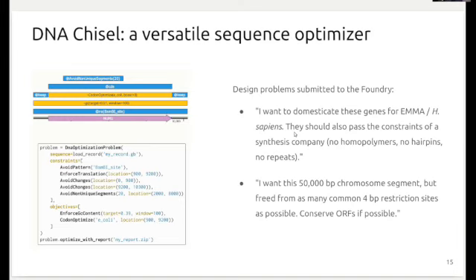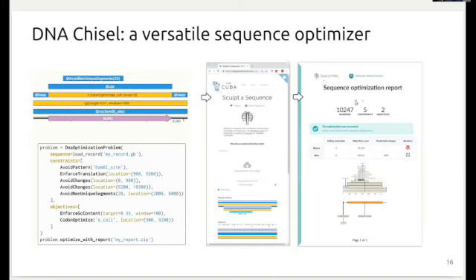And then it provides a nice report on that: what has been failing before and after, how the sequence looks, and we have an annotated sequence as well with the mutations introduced and so on.